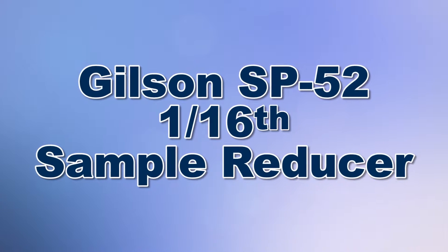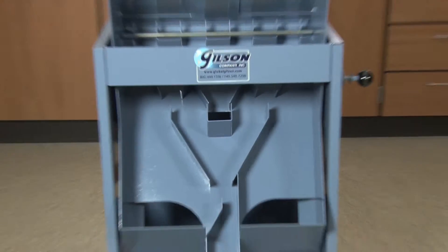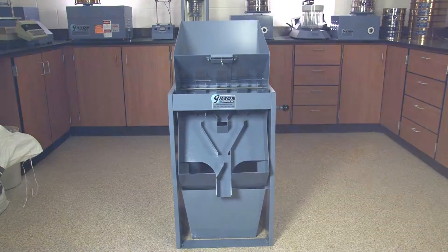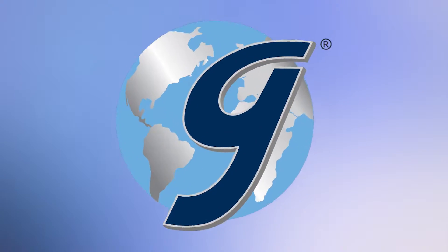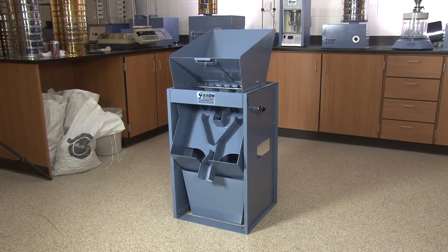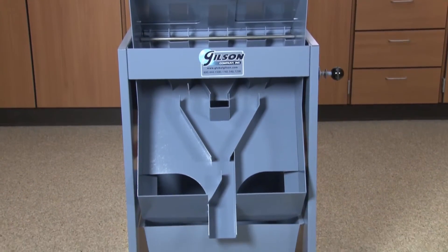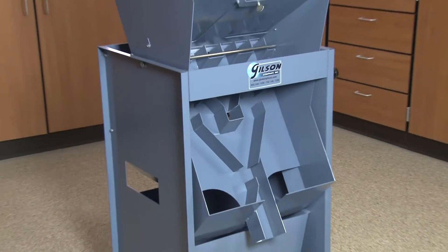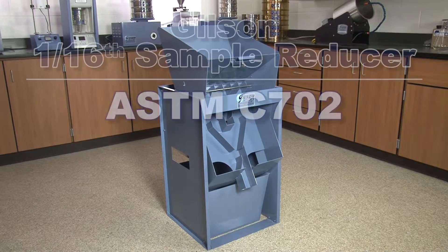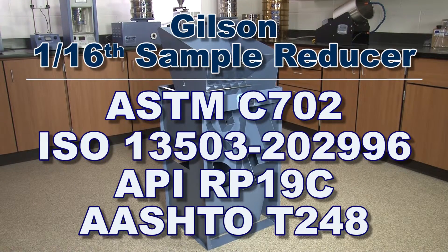When you need reliable representative samples for accurate laboratory results, GILSON is your best choice. The GILSON SP52-116th Sample Reducer will easily and accurately reduce bulk samples into a precise 1/16th representative specimen. This rugged unit meets the requirements of ASTM, ISO, API, and AASHTO test methods.